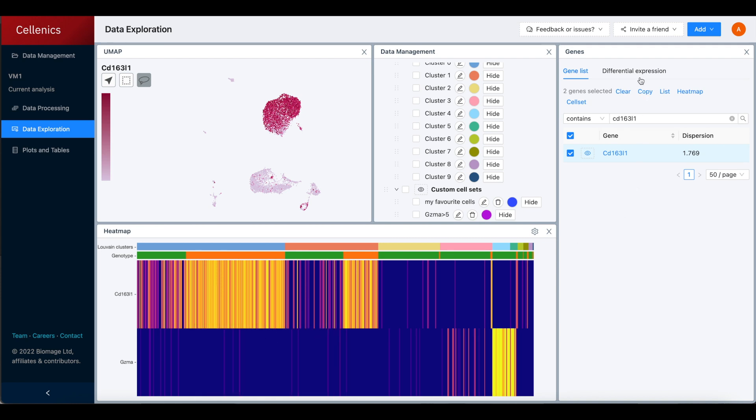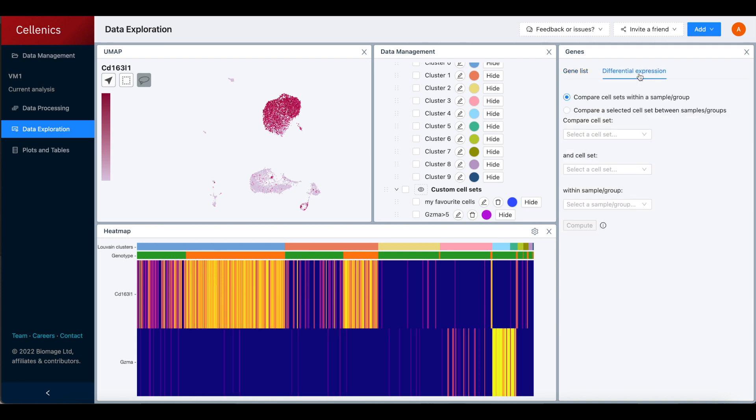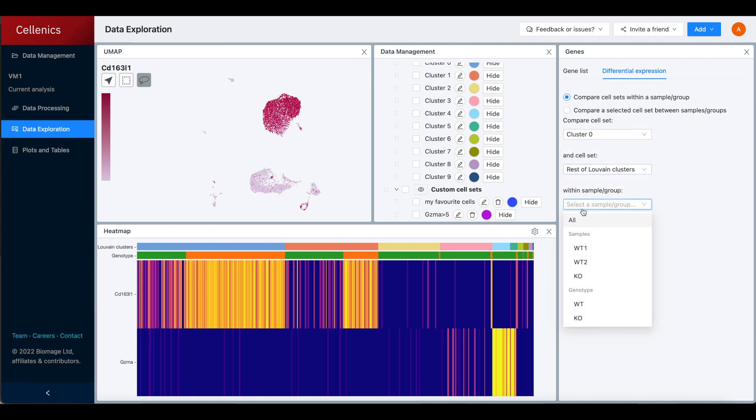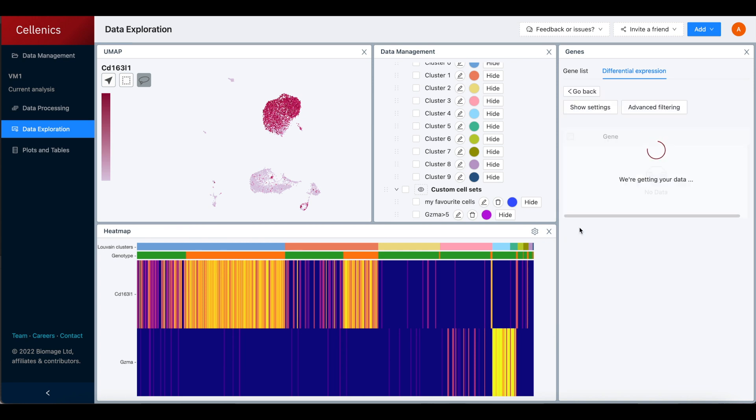Differential expression can be calculated using the differential expression tab on the right side. Calculating differential expression between cell sets within a sample or group will show a full list of marker genes for the selected cell set.